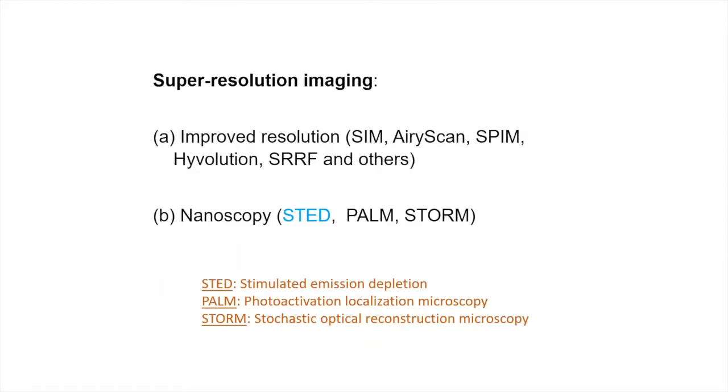And I'm going to dwell quickly on some of these super resolution imaging techniques. I classify them into two categories. They all call themselves super resolution, but I consider some of them improved resolution. They go below the diffraction limit, but within twofold.